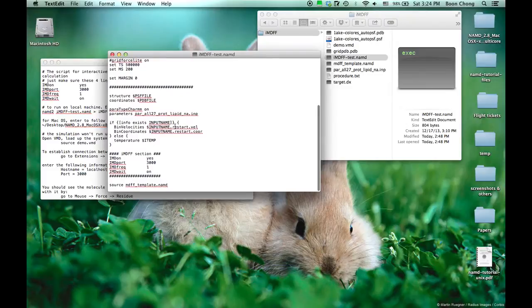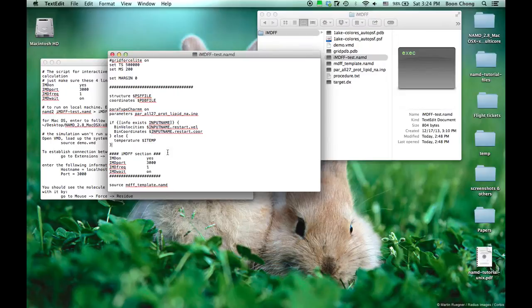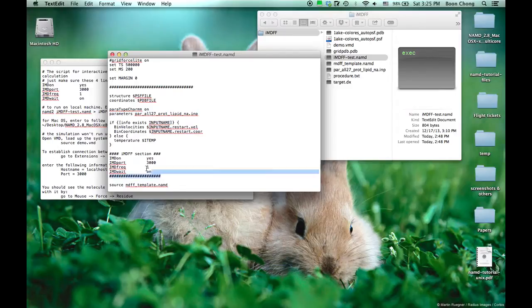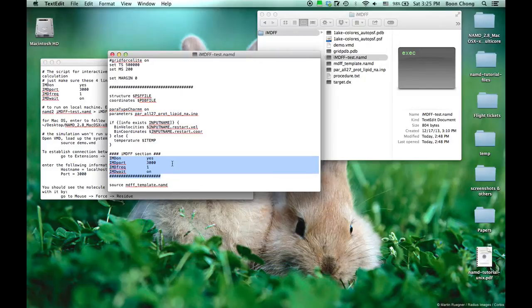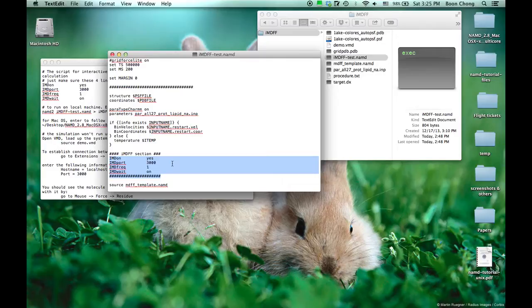The key difference between an IMDFF script and a standard MDFF script is these four lines. You just add them in. It will establish a connection between NAMD and VMD, and that allows you to interact with your MDFF calculation.